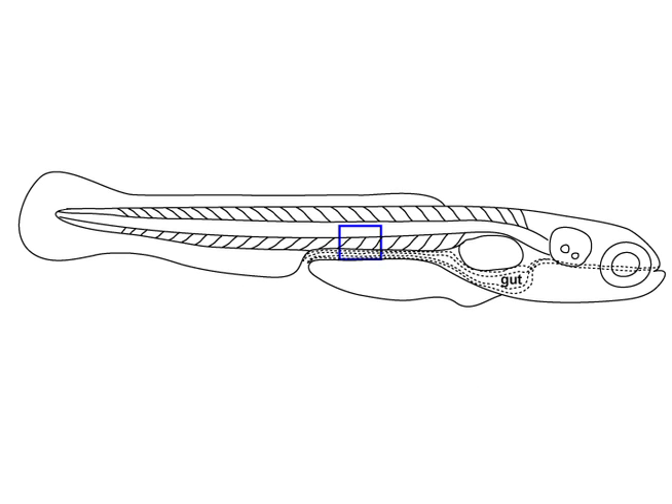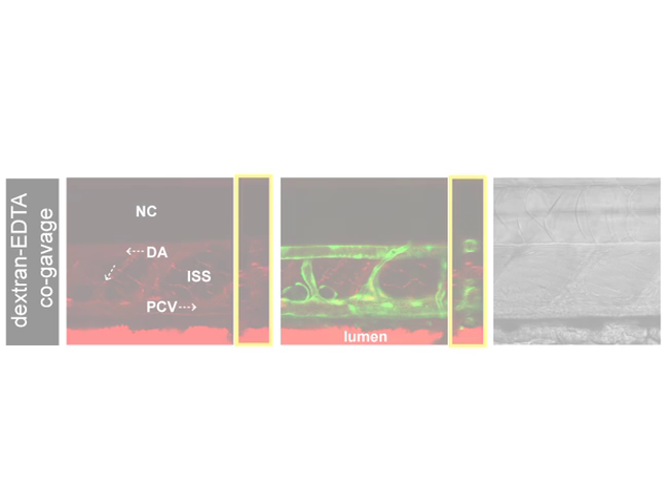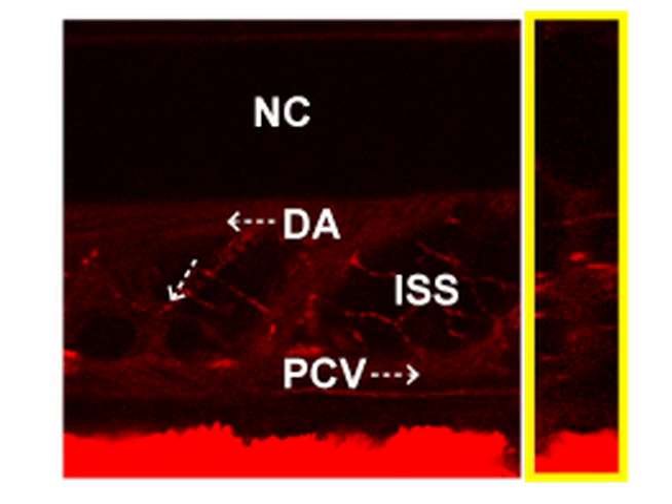Looking at one region more closely, dextran is again found restricted to the intestinal lumen without leaking into the vasculature or extra-intestinal spaces in the absence of EDTA. When co-gavaged with EDTA, dextran is observed in extra-intestinal spaces and within the lumen of the dorsal aorta and posterior cardinal vein. The blurred signal here is due to blood flow.